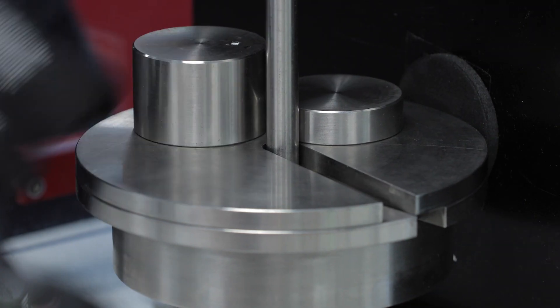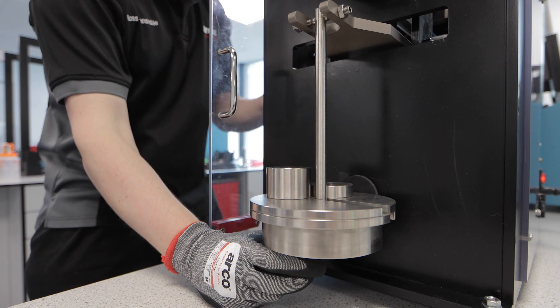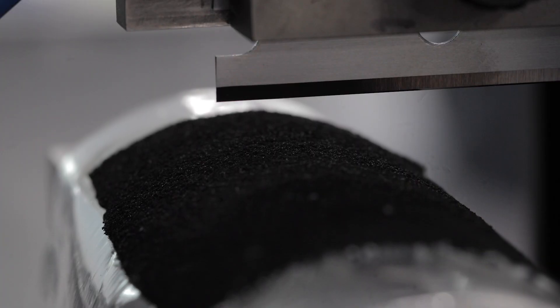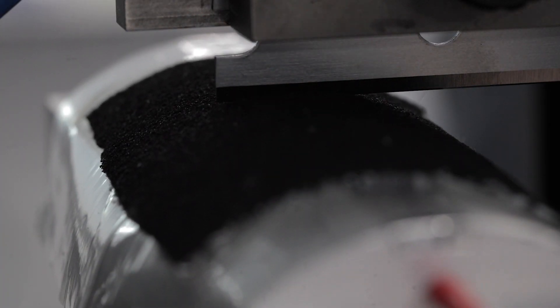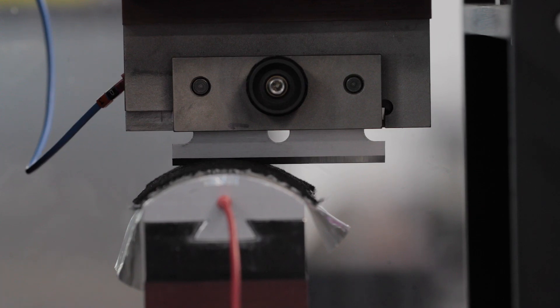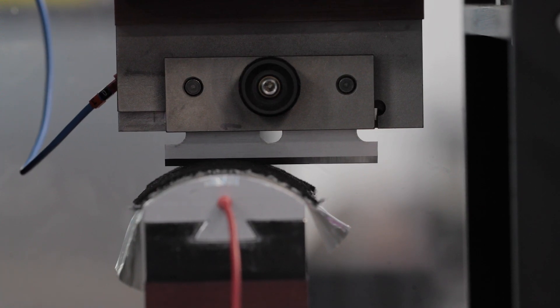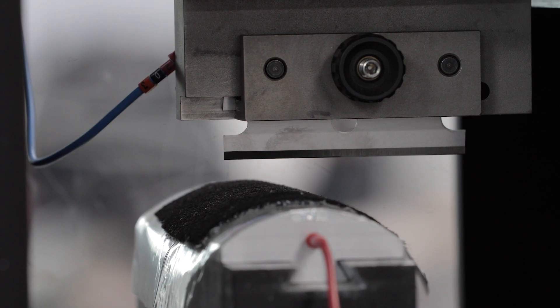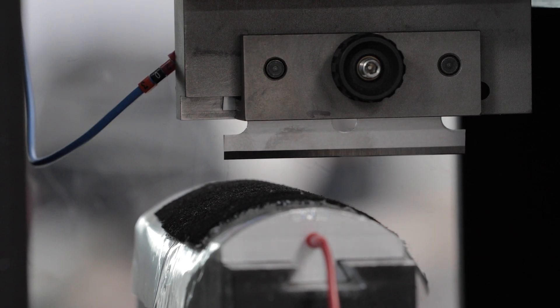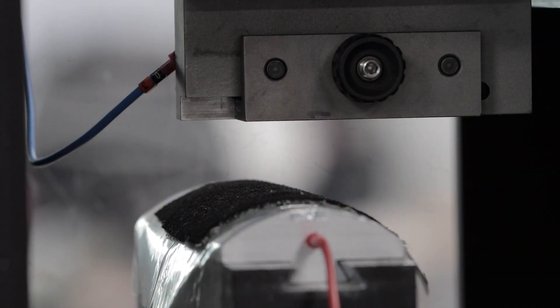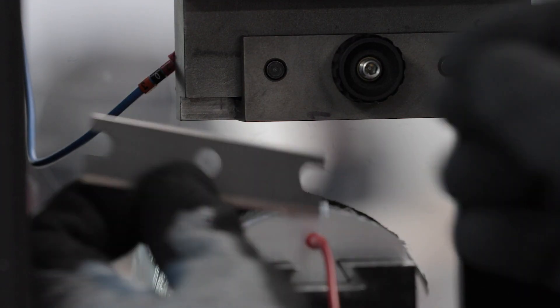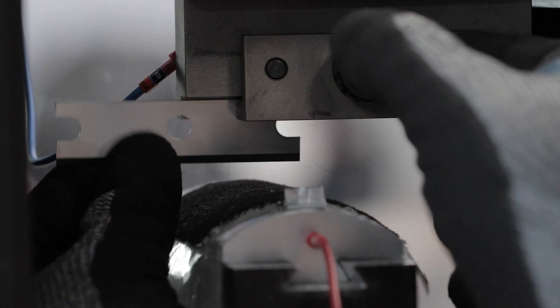The test is run at least a further 19 times with different loads, each time cutting a new section of glove. Unlike the coupe cut test, the ISO 13997 test does not suffer from blunting as each blade only passes once over the surface of the sample and is then replaced.